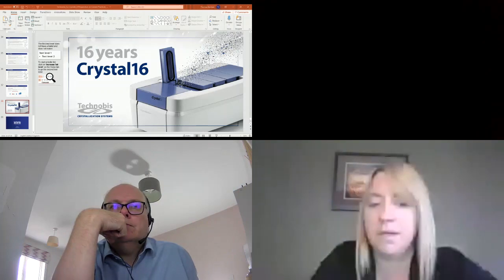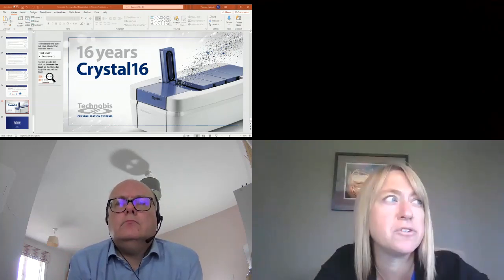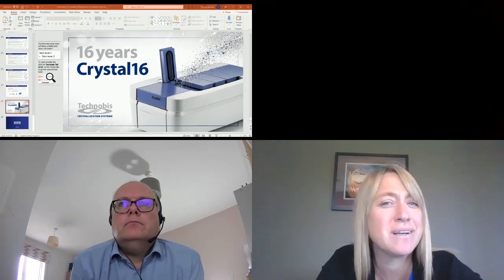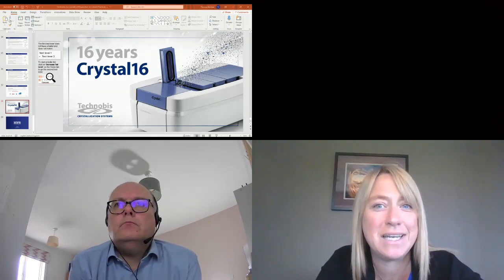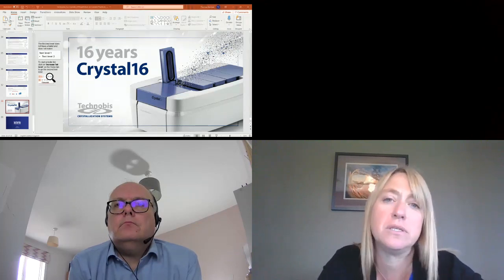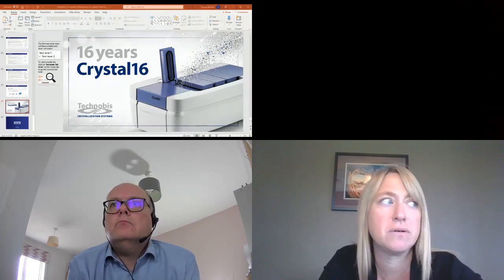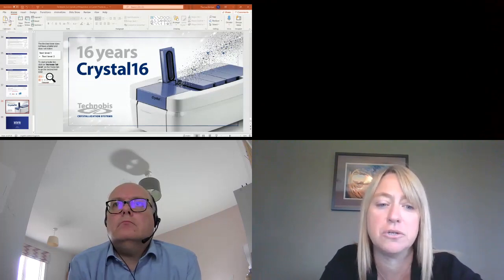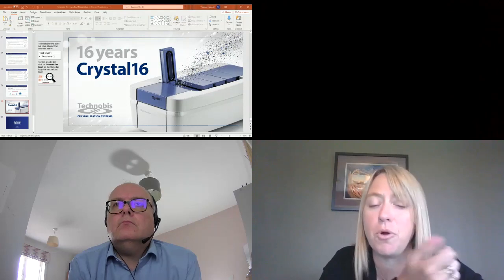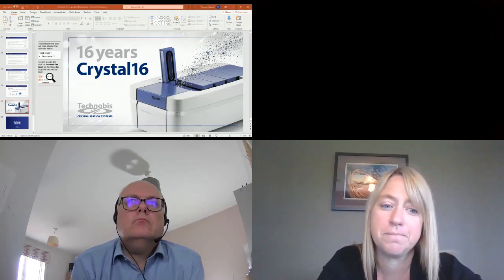I don't know if, Amy, you have any more comments? I do. I also have a little bit of advice. What we're seeing, if you're buying vials from a commercial vendor, such as Fisher or VWR, sometimes the glassware tolerance is an issue. So that may be one solution. I'll touch base with you as well. But what we see is sometimes the threads and the tops are not quite in spec as they should be when you're going through the vendor, Fisher or VWR, on the throwaway disposable vials. Okay.